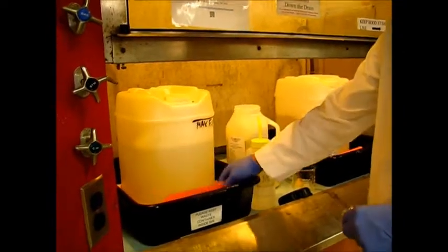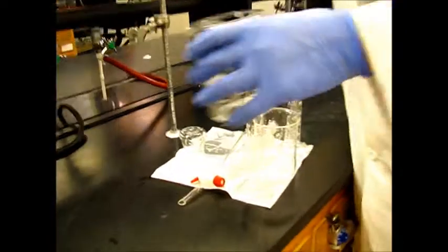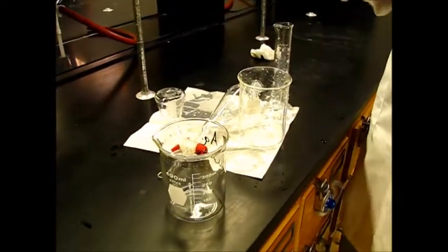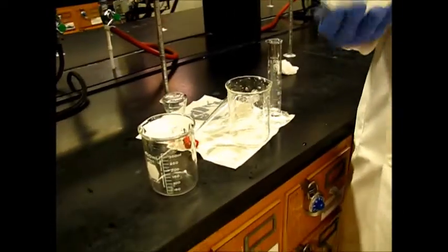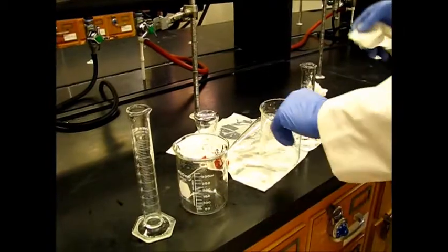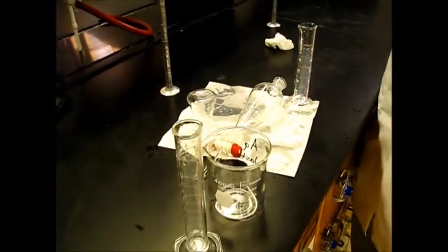So this is a very important process in the organic chemistry lab. You have to clean all the glassware on your own and then dry it for the next student so that they can use dry and clean apparatus.